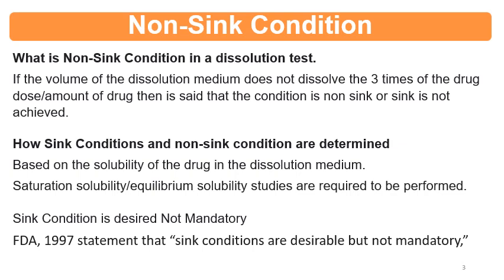Sink conditions are required or desired, but not mandatory. You can find this information in the FDA guideline. In 1997, FDA published the dissolution guideline, and in that it is stated that sink conditions are desirable but not mandatory.